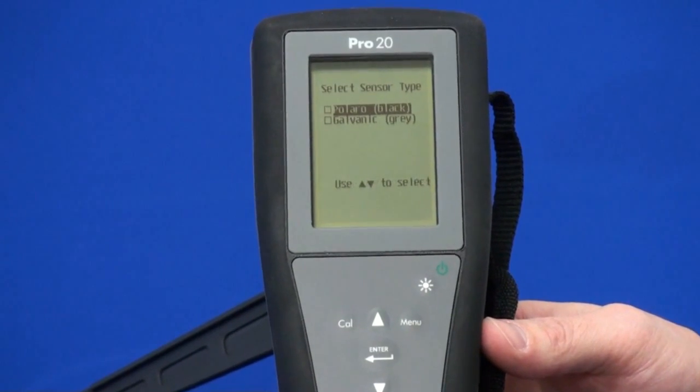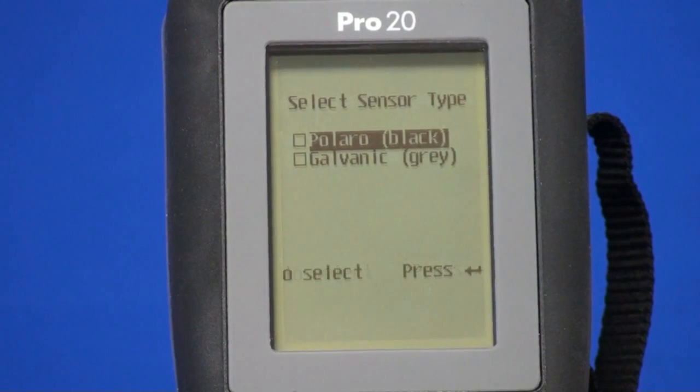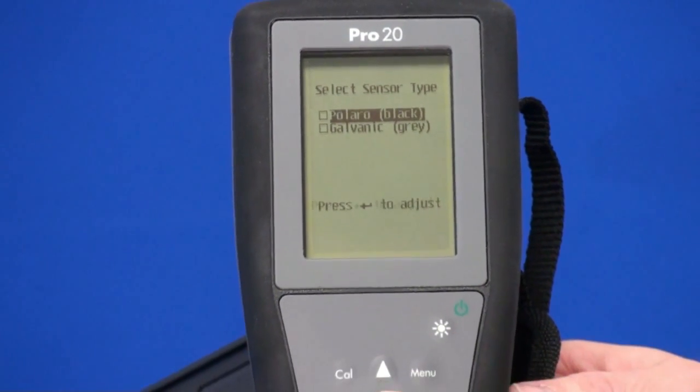The next screen is going to ask you to select which sensor you have. You have a polographic, which is black, and the galvanic, which is gray. We have the black one installed in this situation, so I'm going to go ahead and press enter.